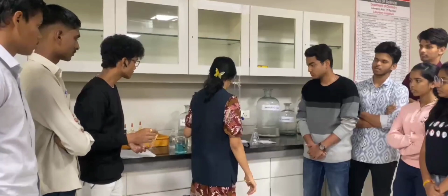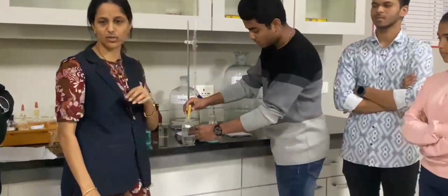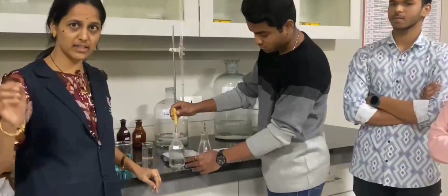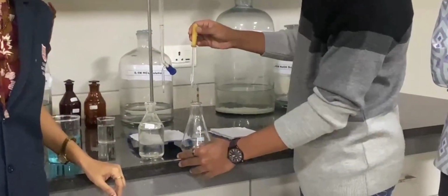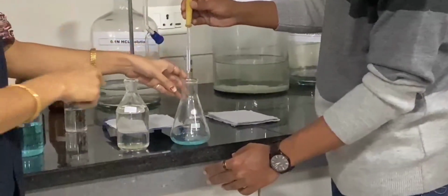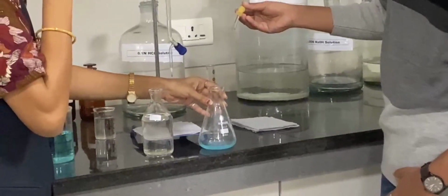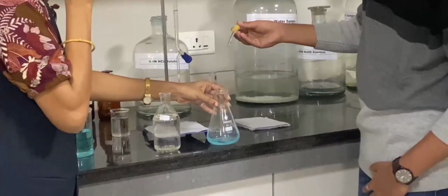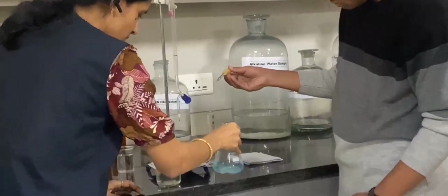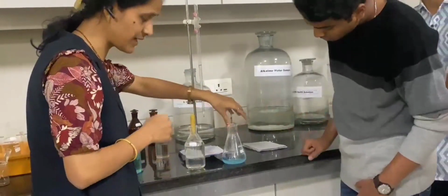Now we have to add sodium carbonate into the stock solution till the turbidity just appears. You can see the turbidity formed in the conical flask. See, this is the turbidity, and if we shake it, the turbidity disappears. Okay, one or two drops we can add, and when we add the drop, turbidity appears, but when we shake it, the turbidity dissolves.